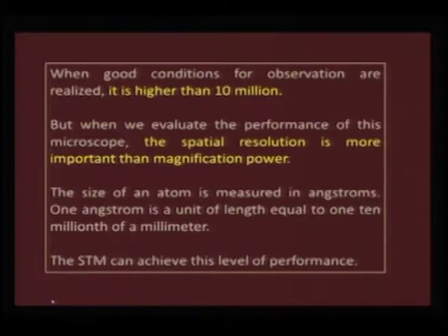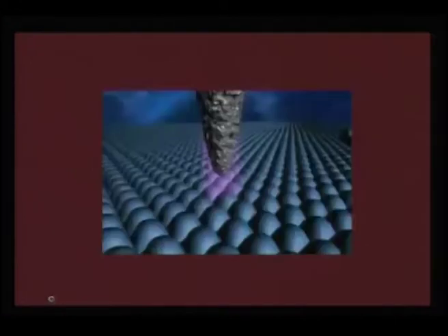The size of an atom is measured in angstrom, and 1 angstrom is a unit of length equal to 1/10 of a millionth of a millimeter. So, we are going to look at the material in angstrom dimension, and this can be achieved by STM.